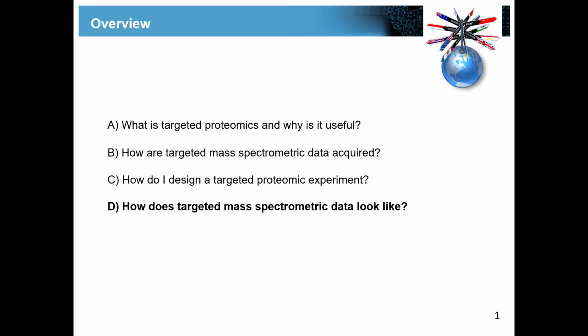That's a major reason that I'm aware of why people like to work with Y ions. However, if you are, for example, generating a spectral library on exactly the same instrument type, or even exactly the same instrument in your lab, where you will do targeted assays, then you can really assume that the fragmentation pattern will be exactly the same. And then I would just include whatever is in there. It's mainly when you shift between instruments that there was a reason to use the Y ions.